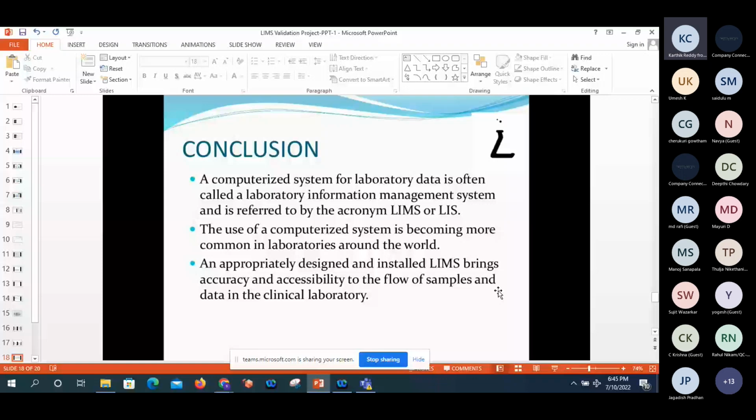if we are implementing LIMS, it is easily acceptable to the regulatory industries, because of how the system is validated. After validation, they can verify all the validated documents produced by the core team, including the validation summary reports. After the real-time analysis performed by the end users, and the approval of those documents in LIMS, everything can be easily tracked, and auditors can easily believe that the system is accomplished in a repeatable way.